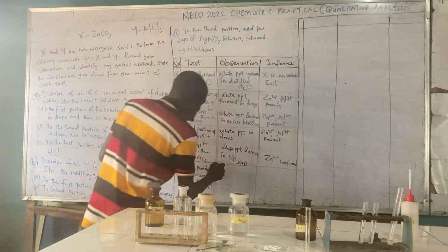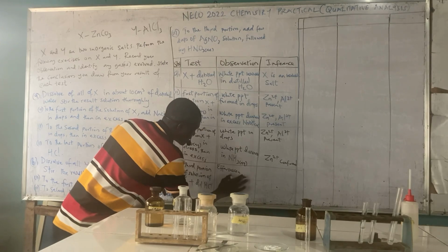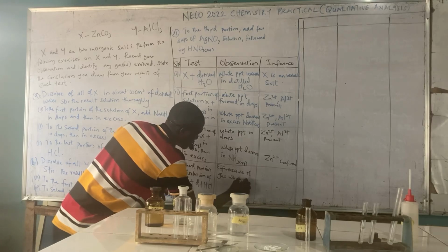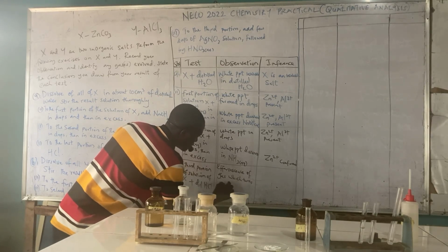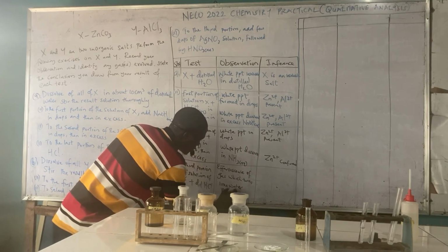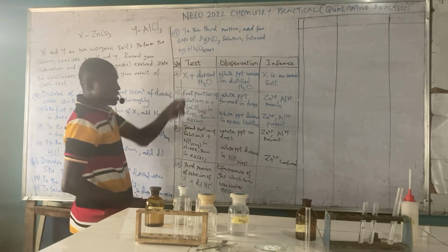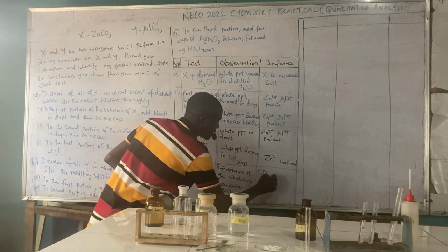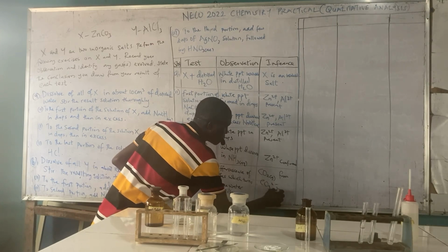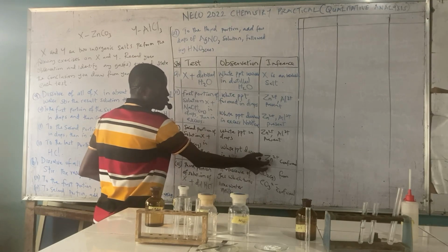So effervescence of a gas which turns lime water milky, and the only gas that has that characteristic is CO2 gas from CO3 2- confirmed.